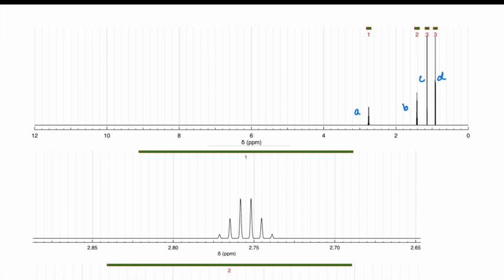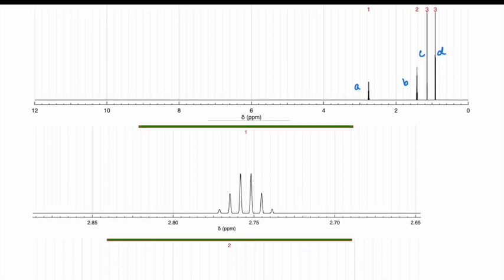Okay, so for this first one here, this one was peak A. That's my peak label. So when we're assigning the chemical shift of our cluster of peaks, we can just look at the middle. Okay, there's 10 between these two. So this one's 2.76. So 2.755. Honestly, if you called it 2.76, I wouldn't be mad about it. Sure, it's close enough. Whoops, not PMM, ppm.